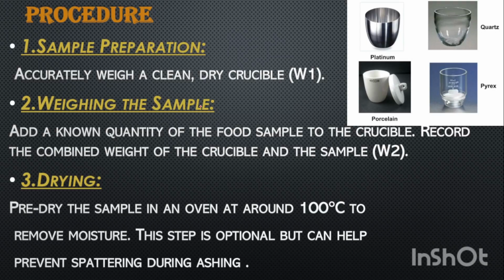This is typically done at high temperatures in a muffle furnace. Even though it is a high temperature, minerals are not destroyed by heating and they have low volatility compared to the other food components. Here, the apparatus used are the silica crucible, weighing balance, tongs, electrical Bunsen burner, and desiccator.